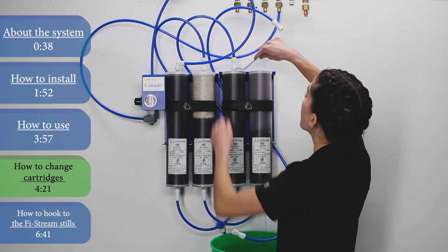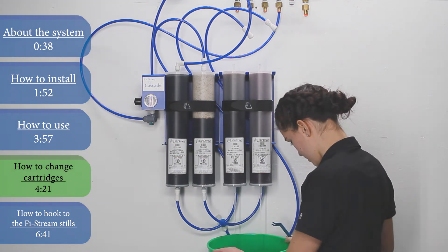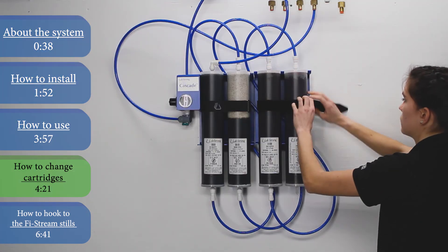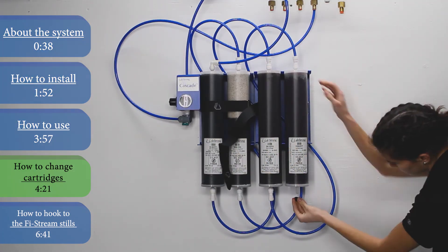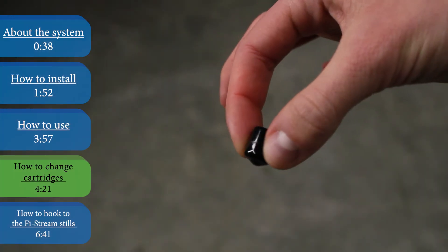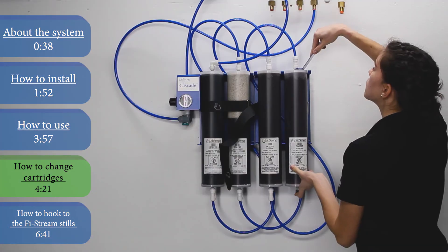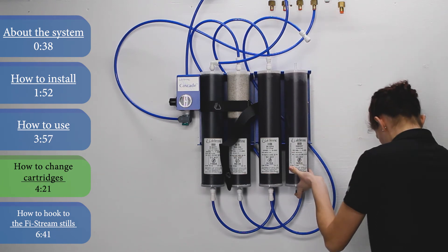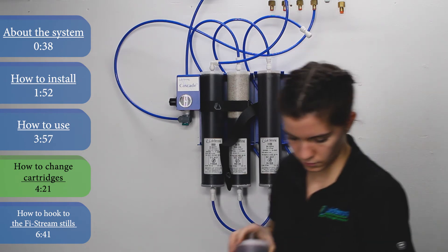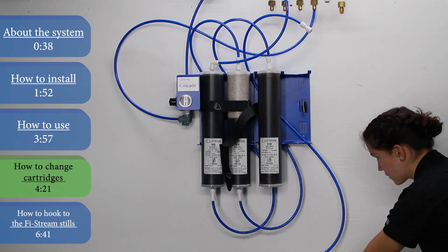Allow time for water to drain from the cartridges. If you don't have the convenience of draining the water where your system is placed, there is an alternative option. After removing the outlet valve from the last cartridge, undo the cartridge straps. Then place the black cartridge cap on the open ending — you can either use the caps that came with your original cartridges or use the caps from your new cartridge kit. Alternatively, you can close off the ending with your finger. Next, use the fitting removal tool to undo the fitting at the top of the cartridge. With your finger or cap still closing off the bottom, remove the cartridge from the system and place it into a bucket or sink to drain the water. Repeat this process for the remaining cartridges.